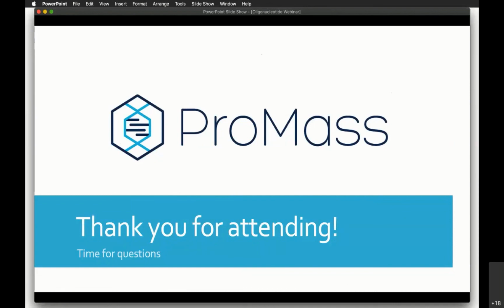Sure. So in most cases, well, this is obviously not applicable to everything, but we hope for a smaller adduct peak. If there's a really high adduct percentage, it might actually be more worth it to change the instrument method or the source conditions. And maybe I could answer Daniel Fletcher's question in the chat here at the same time. He asked what can lead to a depurination during the analysis.